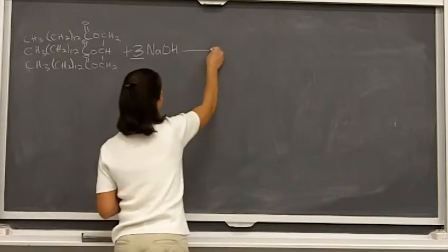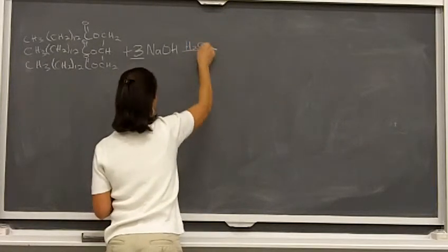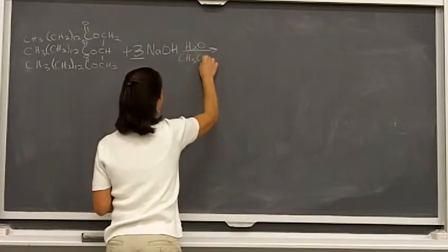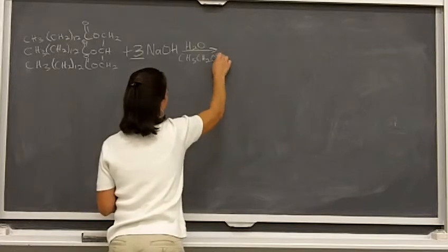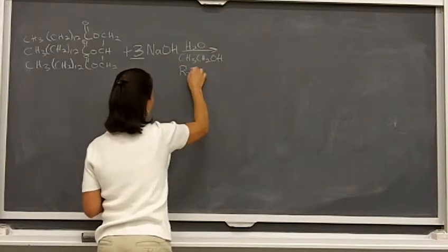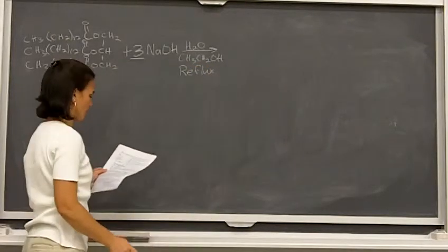This reaction we're going to carry out under reflux, and we'll talk about here in a minute what that means. And we're going to use ethanol as a solvent as well. We've got water from our base, carrying out at reflux, okay? So we're going to add heat to this reaction.